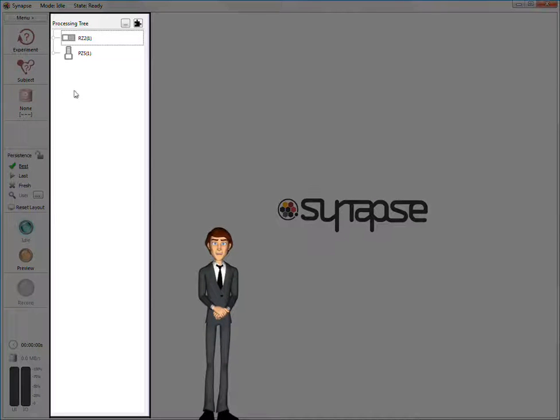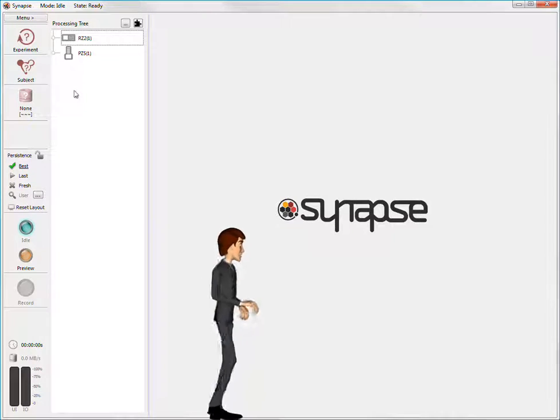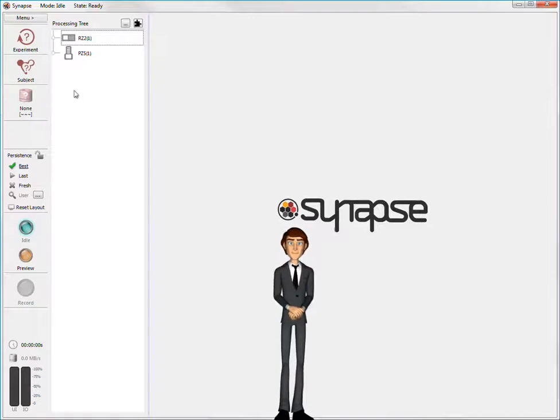In an earlier demo I configured the rig, so the devices in my hardware system are shown here. With that done, I'm ready to build my first experiment. One of the fastest ways to build an experiment is to use a template. Templates give me basic data collection functionality as a starting point when building my experiment.